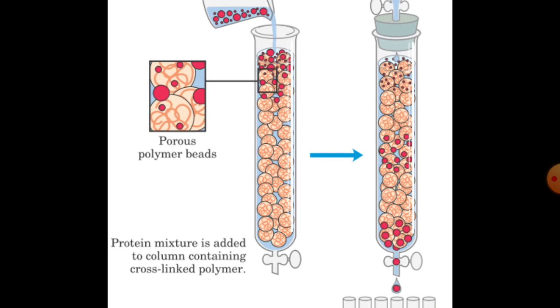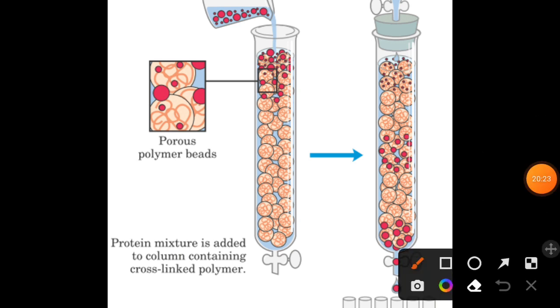Although the resolution of size exclusion chromatography is not very high, and that is why it is often employed as the last polishing step of purification. Okay, so it helps you to determine the tertiary and quaternary structure of the protein when we are performing the entire experiment under native conditions without any denaturing agent that can promote protein denaturation.